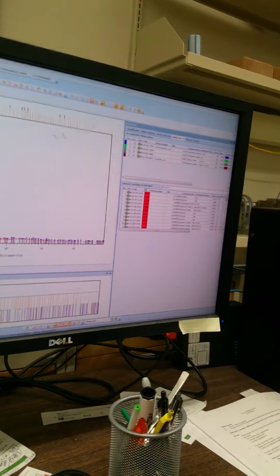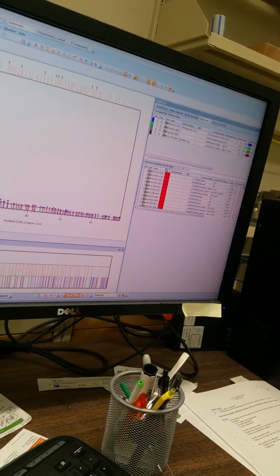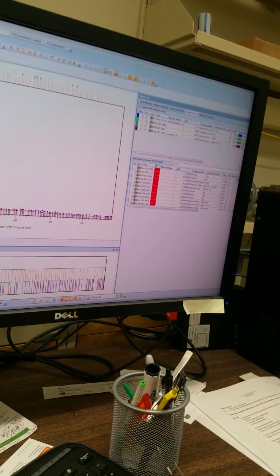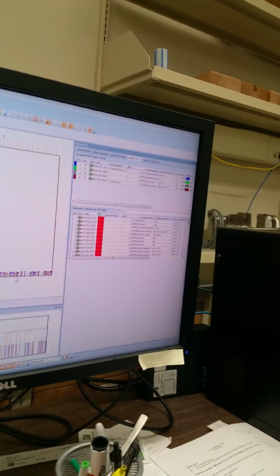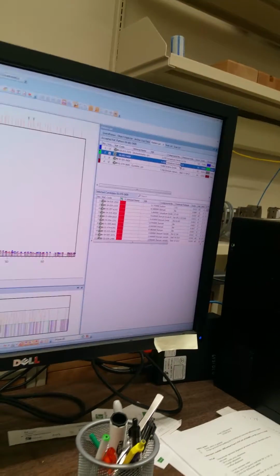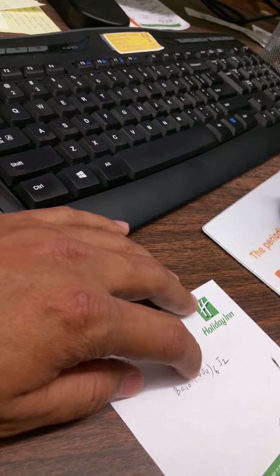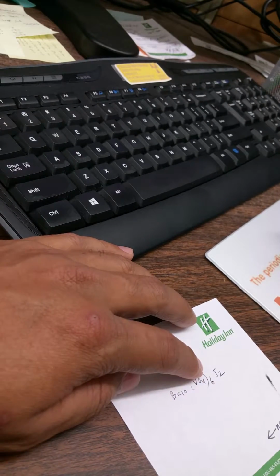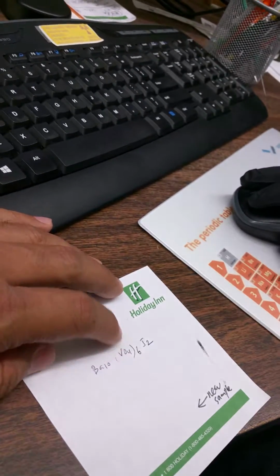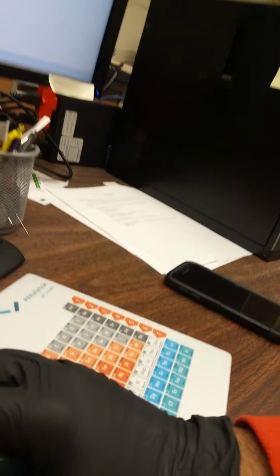Suppose for pure material, for aluminum, the score for a large peak will be like 90, 100, something like that? Something like that, yeah. It'd be really high. So scores above 70. Here vanadium oxide is 35, we can ignore them because our main material is here. Suppose this is V2O5, vanadium pentoxide, VO4, it should be like that. What about that material? Oh, this is 14.